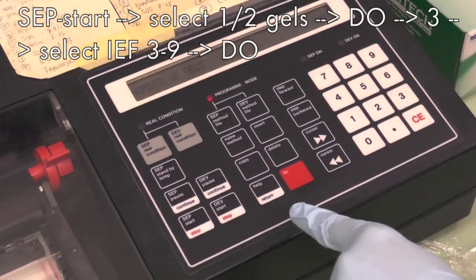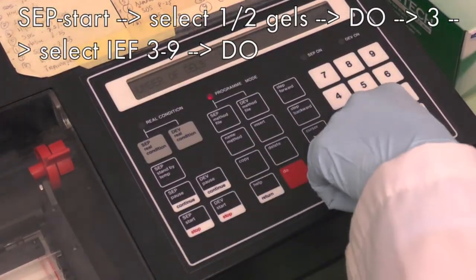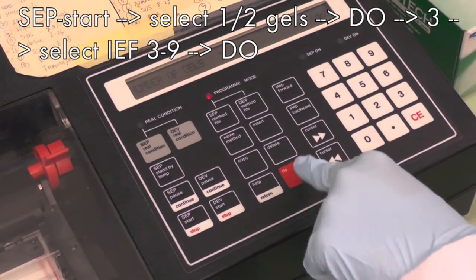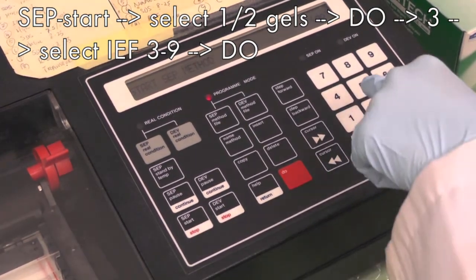Press set start, then 1 or 2 gels, then press do, and then press 3. Select IEF 3-9 and press do.